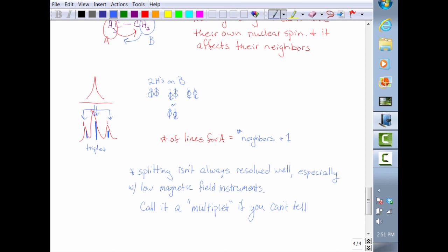They're showing you that chemical shift in the yellow arrow on the left tells you about electronic environment. They're showing you that coupling tells you about the neighbors, and that the peak area or the integration tells you about the number of protons. So each of those little blurbs is color-coded for either chemical shift, peak area, integration, or coupling. And if you want to see, I have a copy over here that doesn't have the ends cut off.